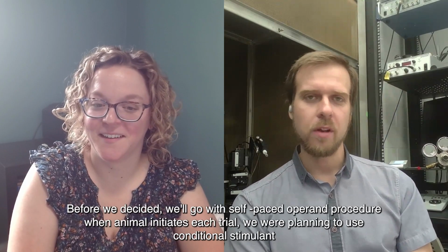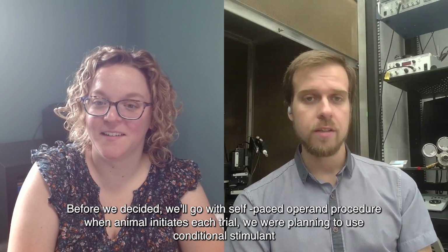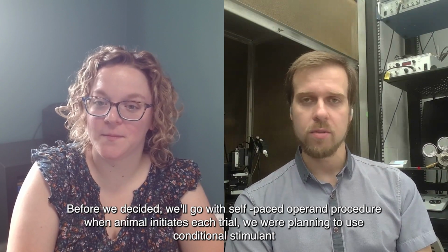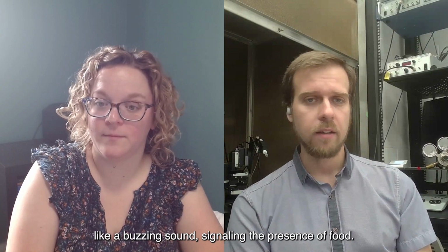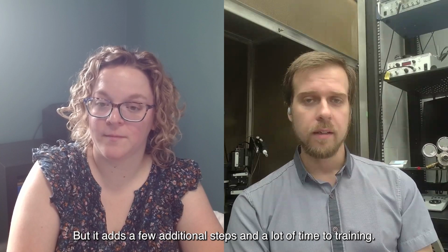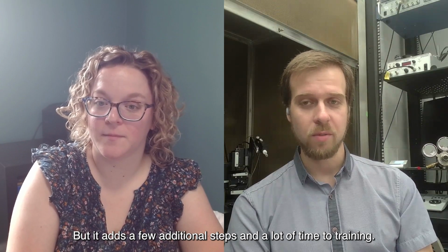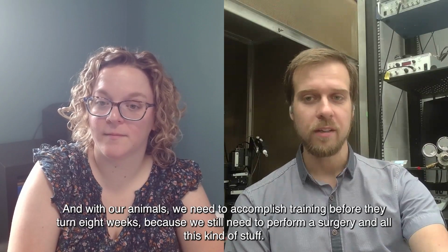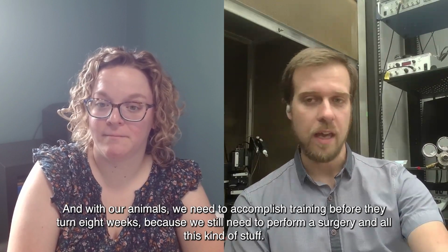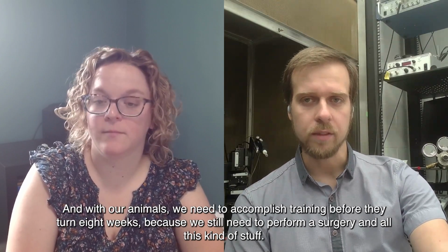Before we decided we'd go with the self-paced operant procedure where the animal initiates each trial, we were planning to use a conditional stimulus like a buzzing sound, signaling the presence of food. But it adds a few additional steps and a lot of time to training. And with our animals, we need to accomplish training before they turn 8 weeks, because we still need to perform a surgery and all this kind of stuff.